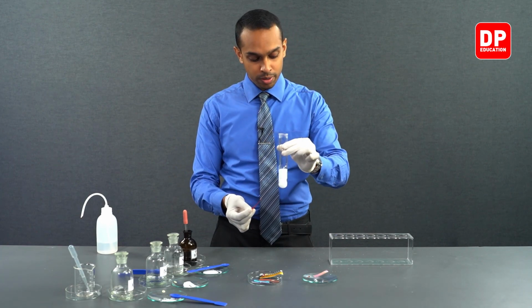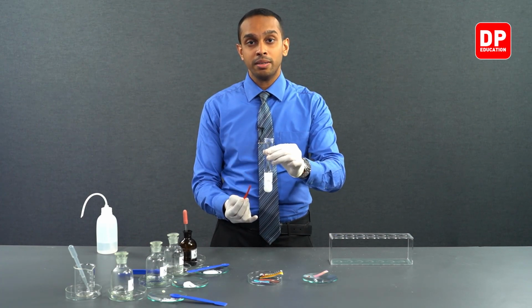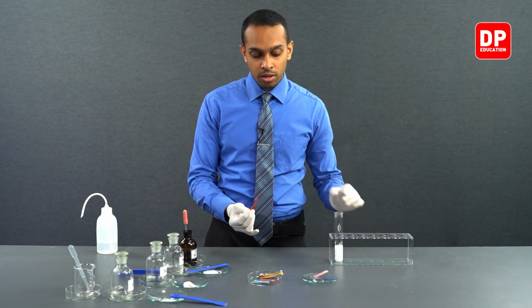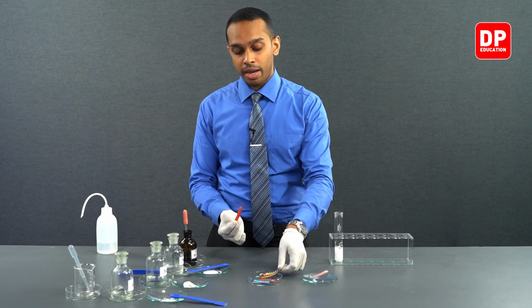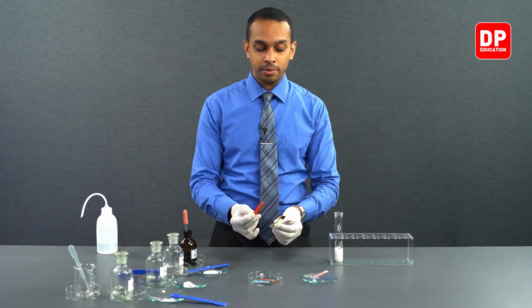Like I mentioned, upon addition of sulfuric acid to sodium chloride, we produced HCl gas, and we confirmed it with the use of litmus paper. Blue litmus paper turned red, and pH paper also turned a red color.